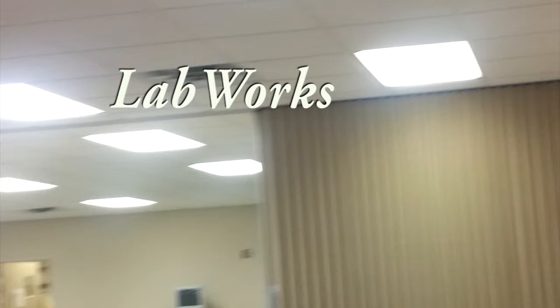Hello and welcome to LabWorks. My name is Andrew Kim, and today I will be instructing you on how to use a laboratory scale, otherwise known as an analytical balance.